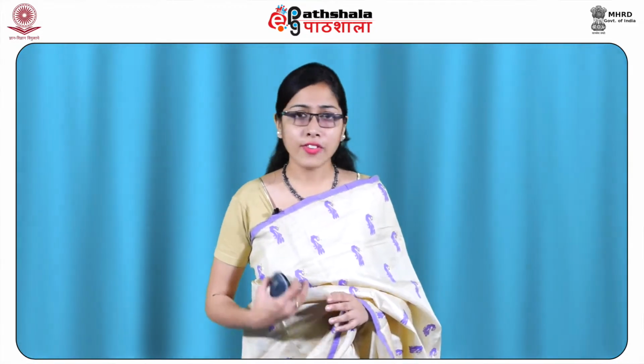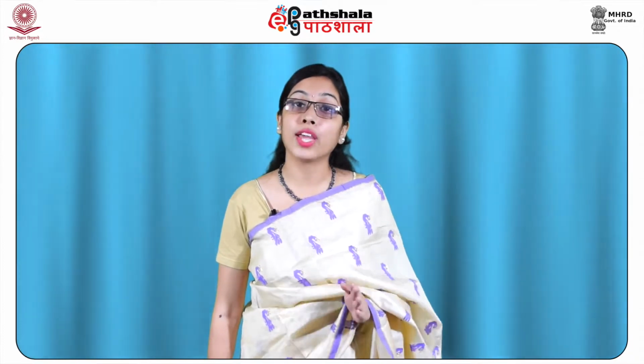The basis of theoretical discussion in this module will be concerned with partition, adsorption and gas-liquid chromatography. With suitable modification, these concepts can be applied in the other types as well. The various types of chromatography are based on the distribution or partition coefficient, also known as Kd, that is used to describe the way by which a component distributes itself between two immiscible phases.